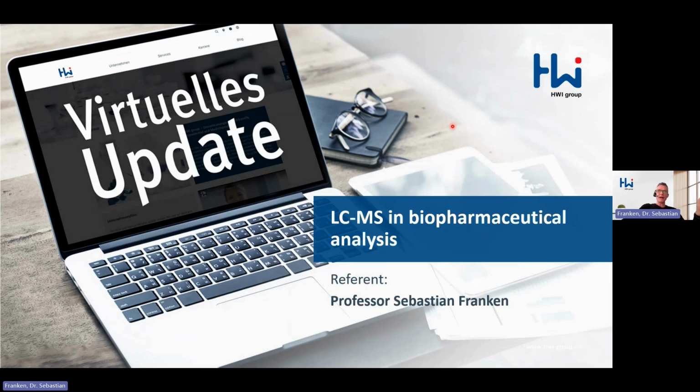Since my last update dealt with the analysis of biopharmaceuticals in general, today I would like to take a closer look at the role of LC-MS as a technique for the analysis of these drugs.